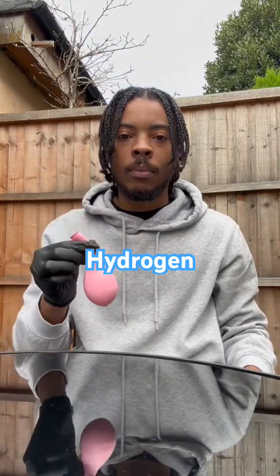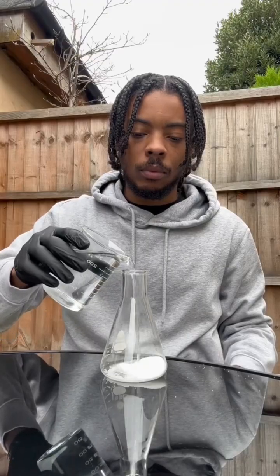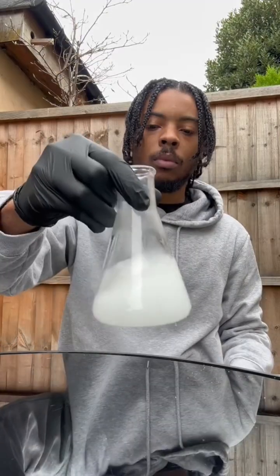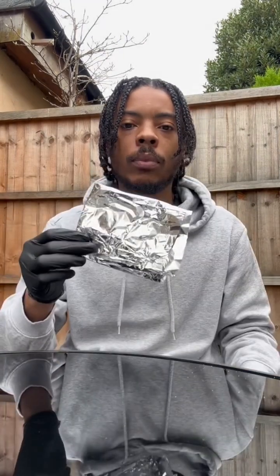Alright cool, so I've got a little balloon there and I'm going to fill it up with some hydrogen gas and then blow it up. But obviously I've got to make some hydrogen first, so I've got a little sodium hydroxide and I'm adding it to some water. This creates some sodium hydroxide solution and then I'm going to add a little foil in that.